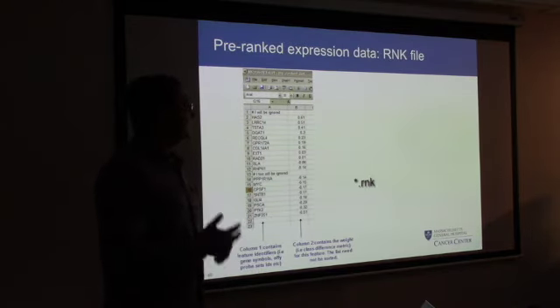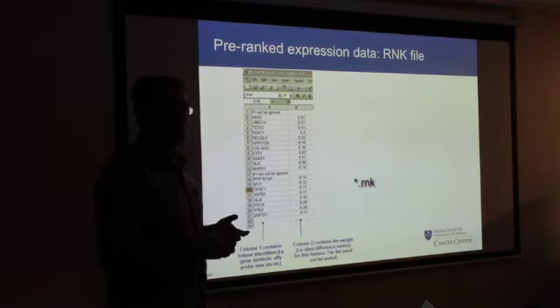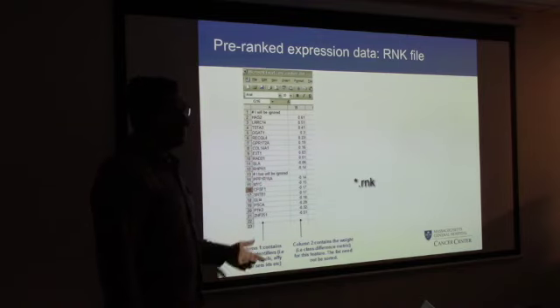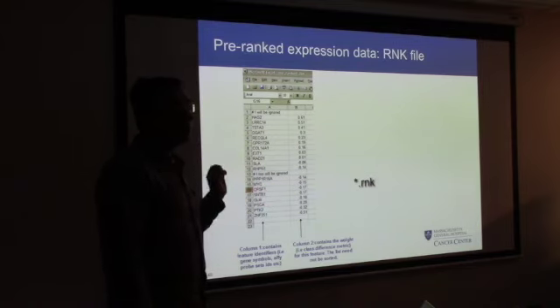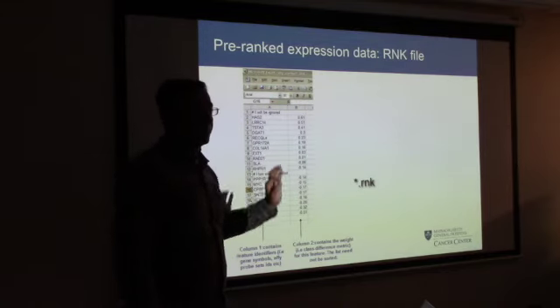For RNA-seq, we've already done the differential expression, and therefore we have our genes pre-ranked by log fold change or fold change, or any other order that you think is relevant. So we usually use a pre-ranked file or a ranked file. This should end in .rnk. This is important: it will not recognize a text file, so you need to make sure that it is a .rnk. It's essentially a text file, but you need to call it a .rnk file.